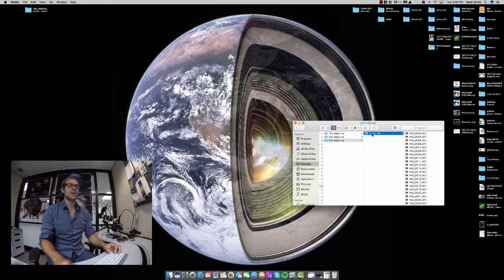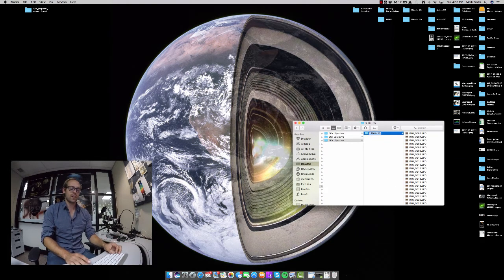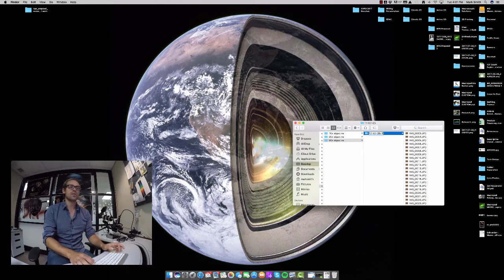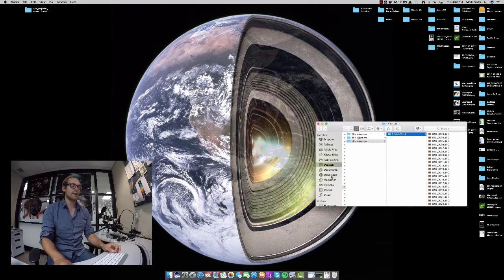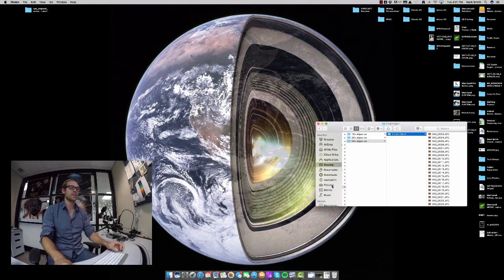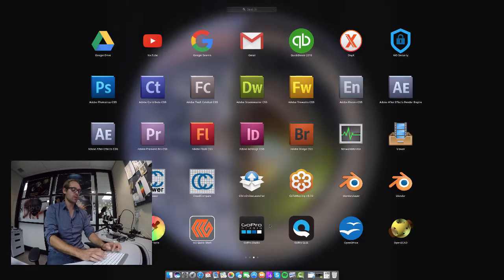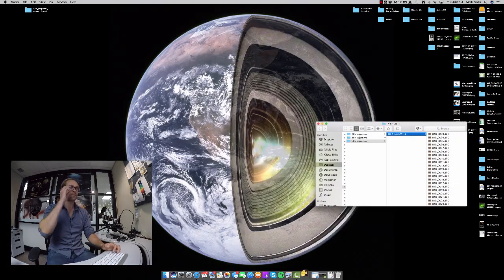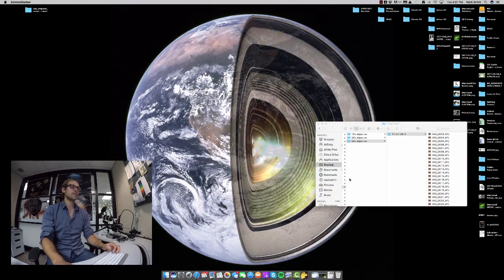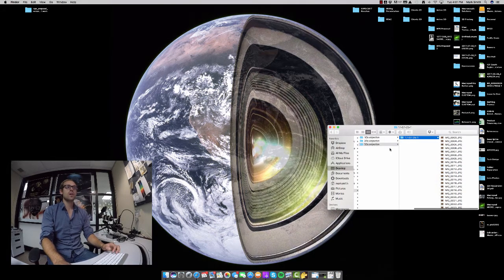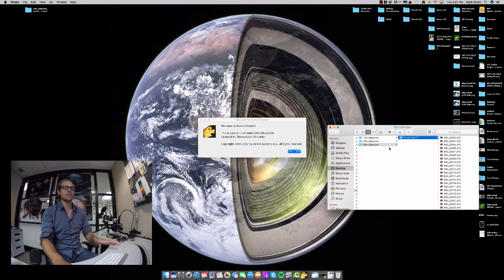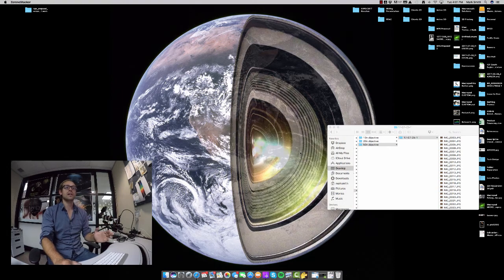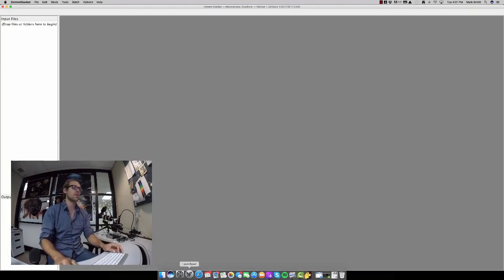So we have our images, they're stored here. We're not going to be taking any other images that we're storing in this folder, but just out of habit, I always just add a one just in case I want to redo or recapture some photos. If I find there's an error in the stacking process and so forth, then we can easily redo it. So what we're going to do now is open up Zerene Stacker. Same as all the other objectives, we captured all of the photos with the 50X objective from back to front and here we're going to stitch them together from front to back.